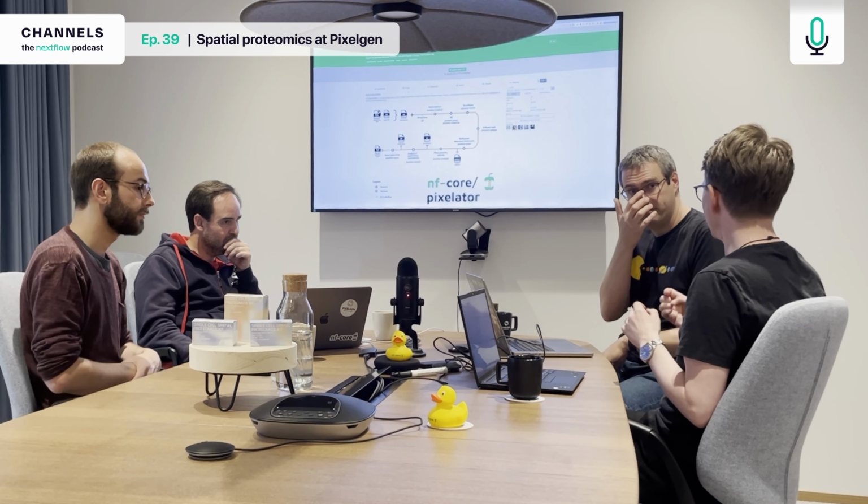Yes, you can run them anywhere you like, basically. We pre-compute these coordinates, and then we will provide, and we already show this on our tutorial pages today, how to visualize this using Plotly, for example. But anything that can plot these points can plot them. The main thing is getting the coordinates.